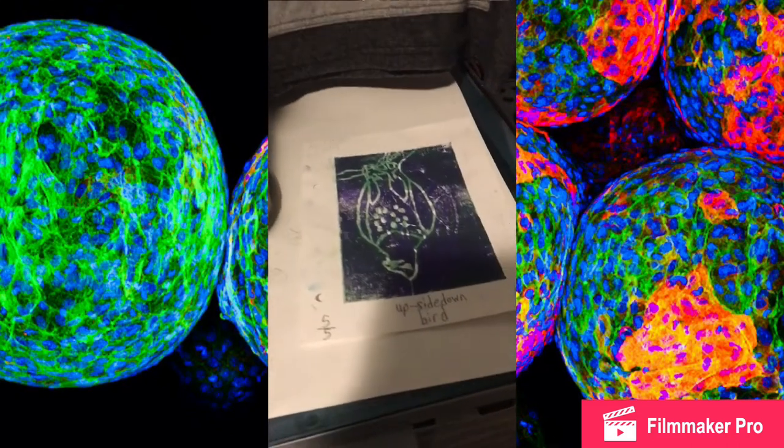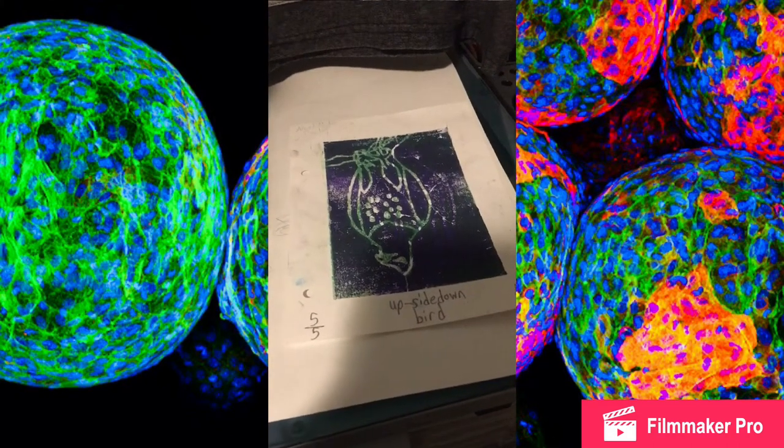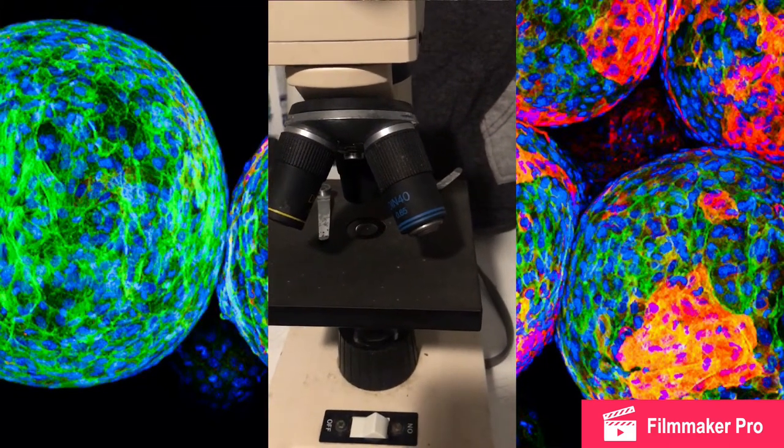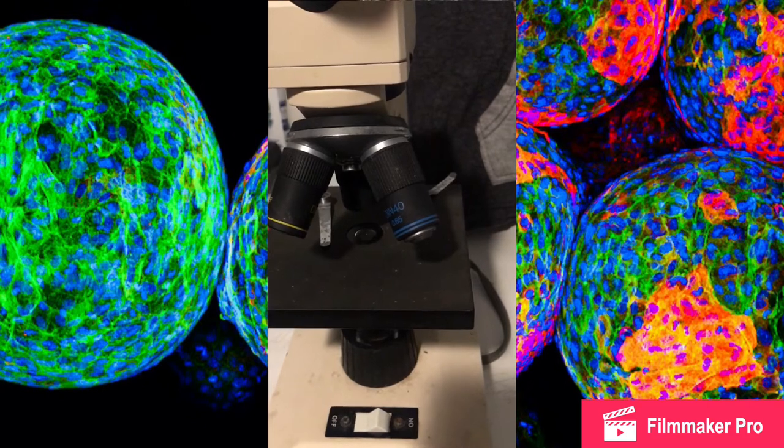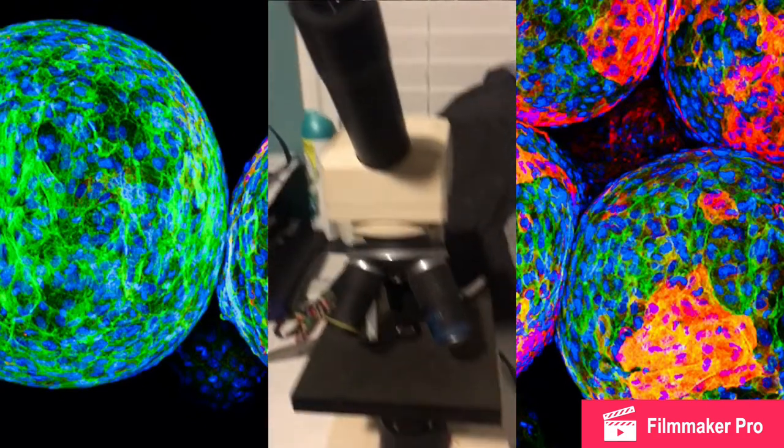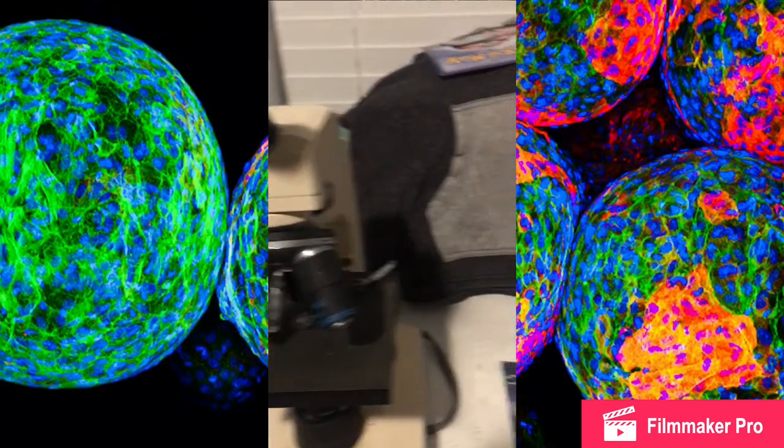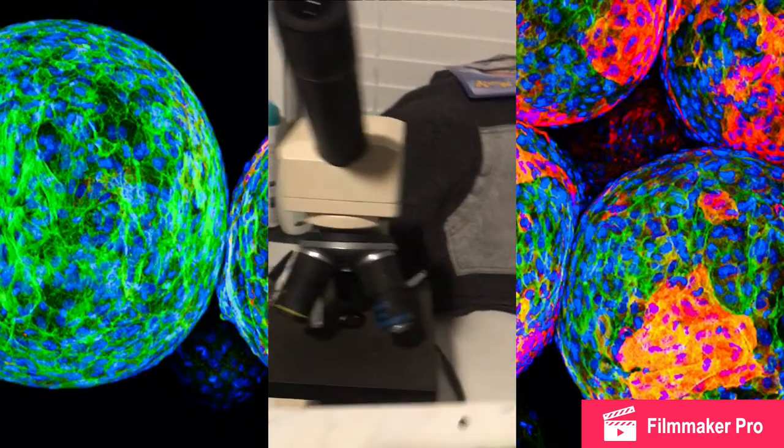Right now I have something I drew in fourth grade, and I want to see what it looks like underneath a microscope. This is the microscope I'm going to be using, so let's get to it.